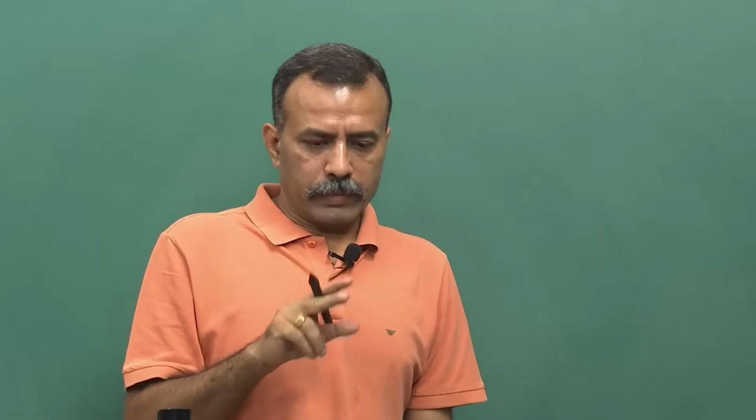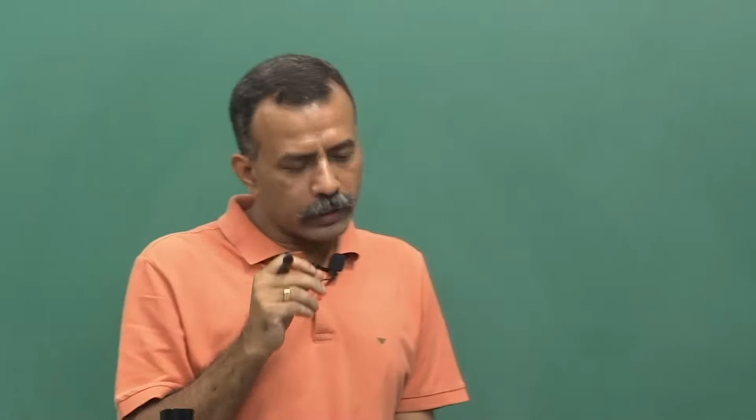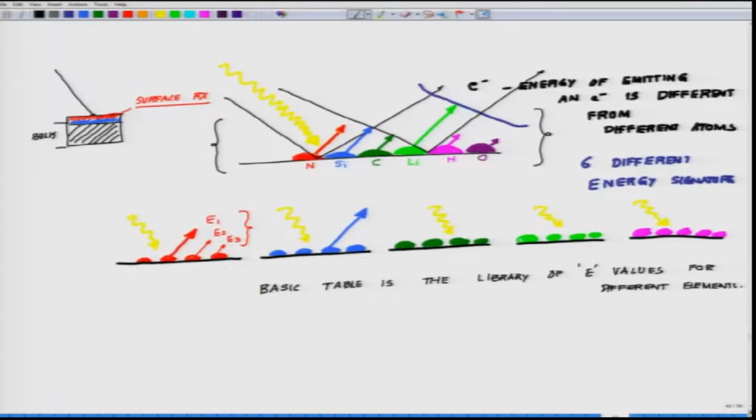Using this technique, you can even quantify. It's a little tricky to do so, but you can actually quantify the amount of carbon, nitrogen, and all other XYZ elements out there. And if you can quantify, you can develop a ratio.